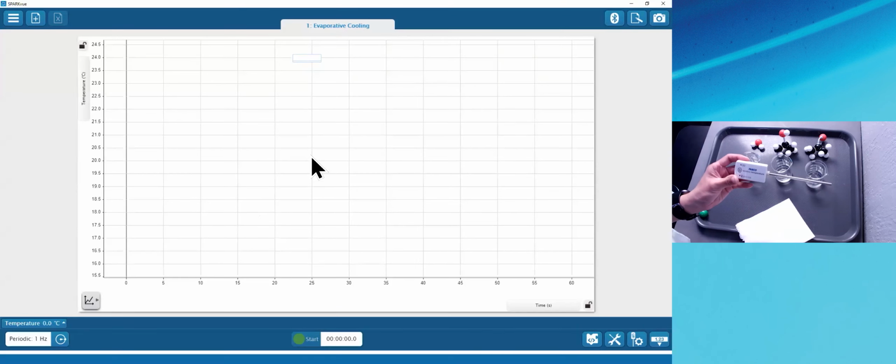The next thing they do is they connect the sensor. All the sensors are wireless, so you turn the sensor on. And by the way, this sensor is battery-powered, and you can tell because on the back it has a battery door. It tells you what the battery number is when it's time to replace it. These batteries last a pretty long time, depending on the type of sensor. The temperature sensor doesn't use too much power. I've had this one for years, and it's barely starting to tell me I've got a low battery. It really depends on how much you use it.